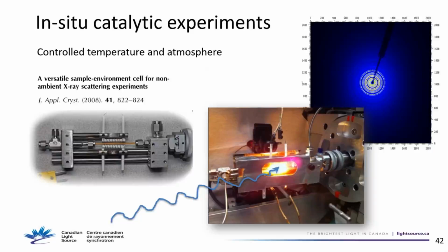I never need more than 3,000 psi. But there are other high pressure setups that give you lower pressures and more sample volume, which can be convenient. Perfect. We're getting something like 20 GPa. But that's for the pressure that you want. You might get away with the supercritical cell. I don't know how they compare.